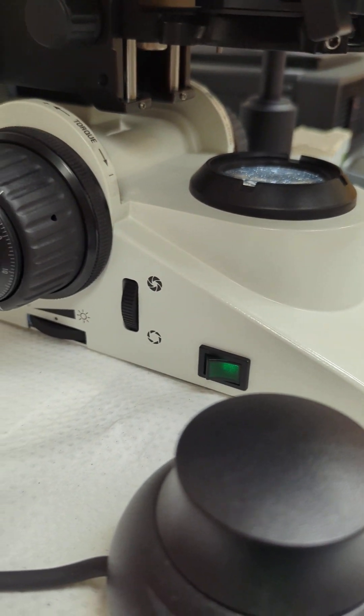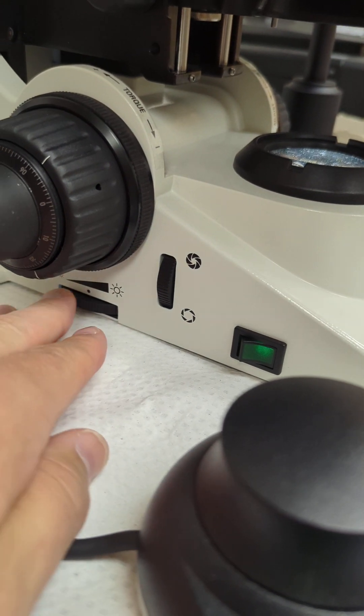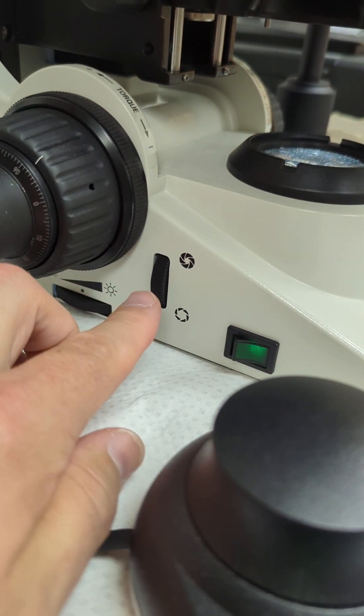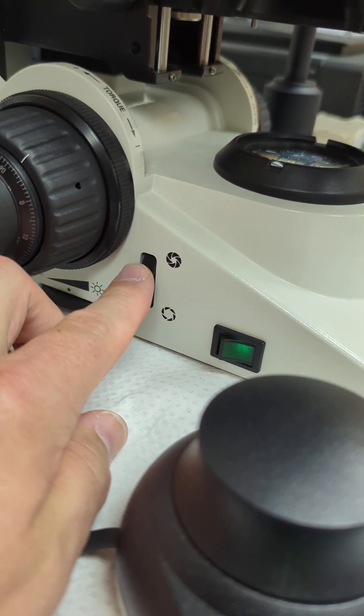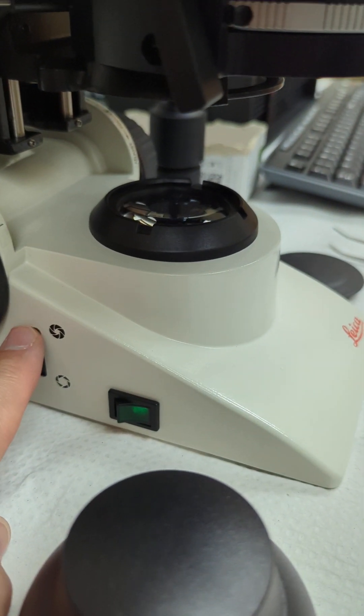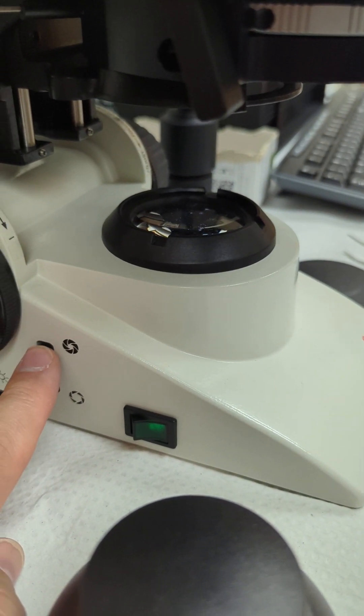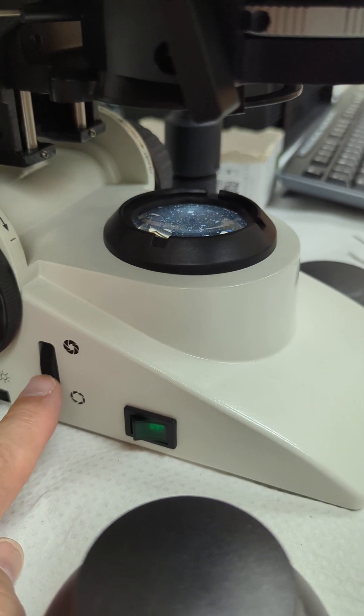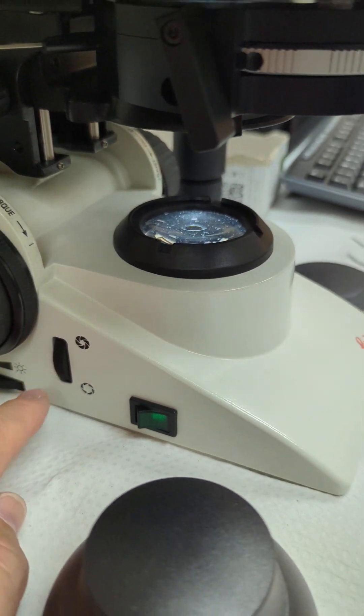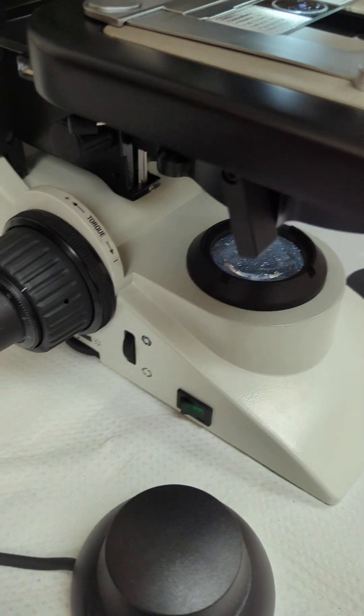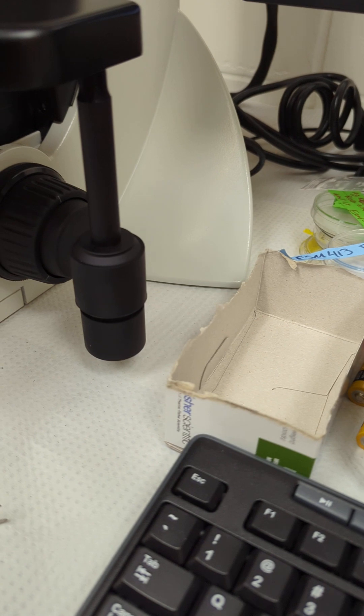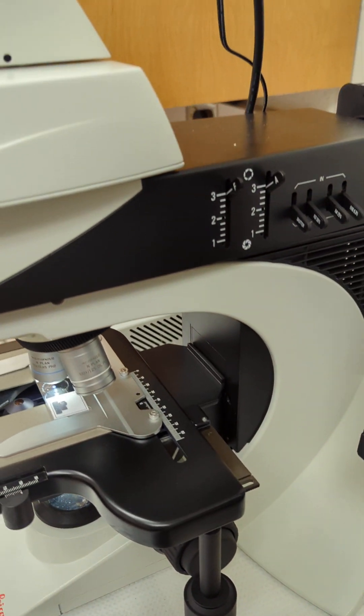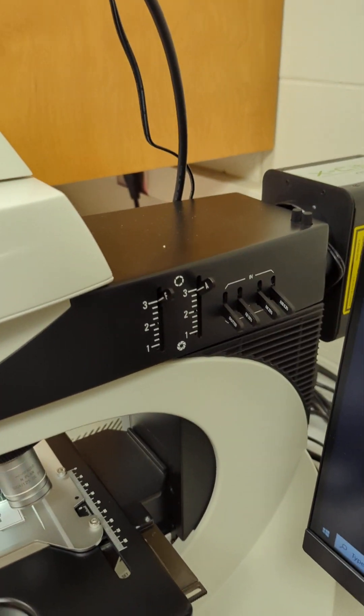Then you've got your light intensity power switch and your field aperture. You can see what that's doing to the light coming out of the base. Your transmitted light shutter is kind of opening and closing, or your iris diaphragm, over on the right side.